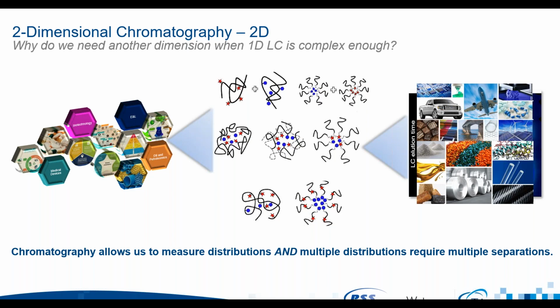So, for example, for fundamental structural analysis, you might need, say, GPC, NMR, IR analysis, even things like Raman spectroscopy, as well as maybe thermal techniques. And then once we get up to the bulk type properties, you might be looking at surface techniques to fully understand the picture of what it is you've made and the properties that go along with that product.